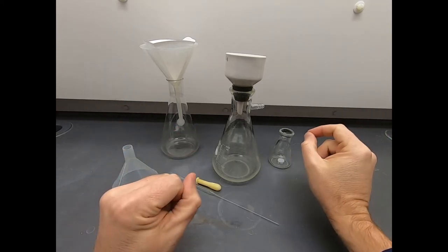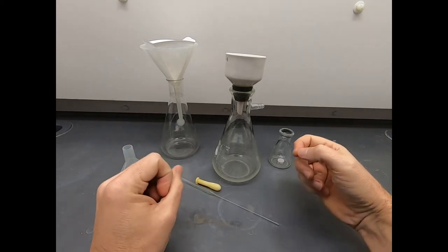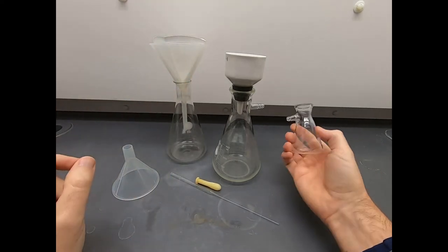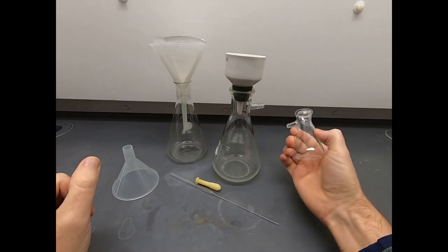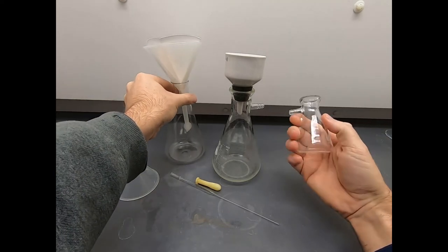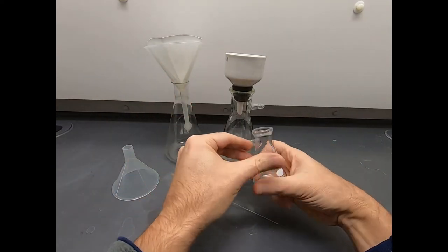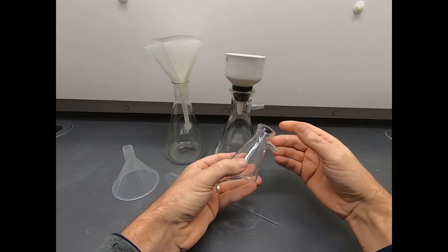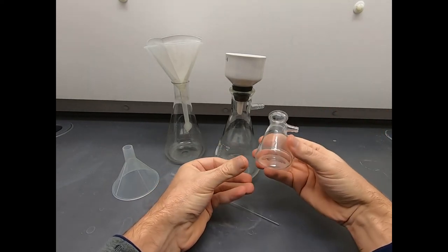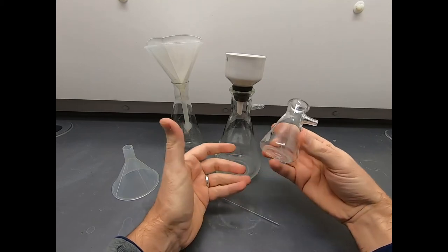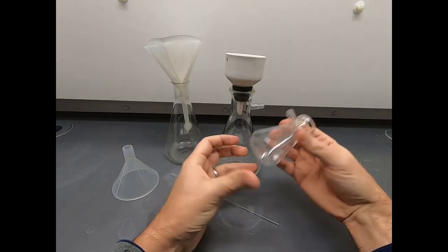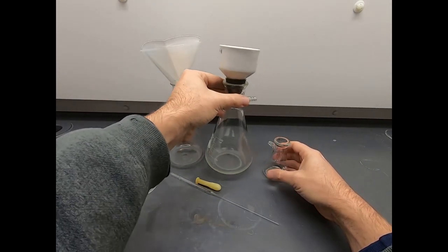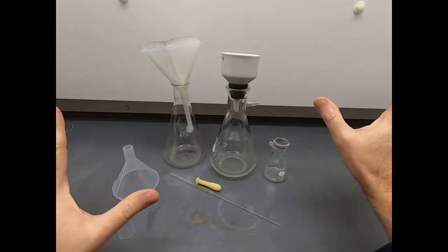You will find in the collection of Erlenmeyer flasks some of the filter flasks mixed in. If you just need an Erlenmeyer, don't use the sidearm version of the Erlenmeyer because you probably have fewer of these. And if you get all these dirty, there will come a time in lab where you say, okay, now I need a sidearm flask, and you'll look around and realize, oh, I used all my sidearm flasks like Erlenmeyer flasks, and now they're all dirty. So if you just need an Erlenmeyer, use an Erlenmeyer. If you need the sidearm flask, use a sidearm flask. Try to keep their roles distinct.